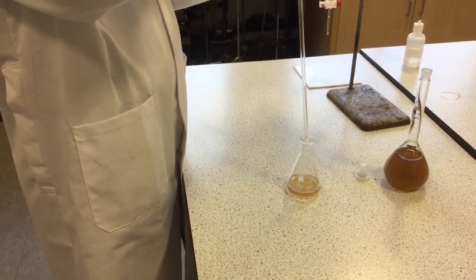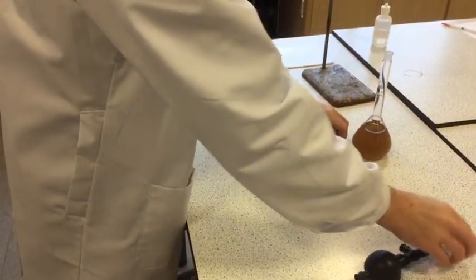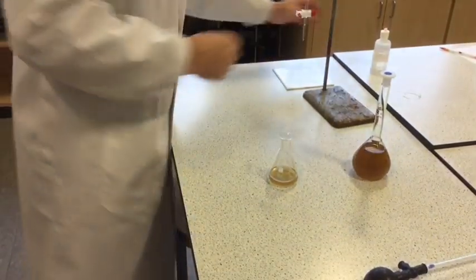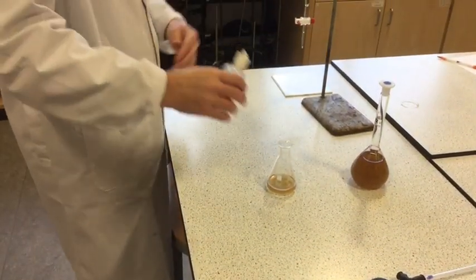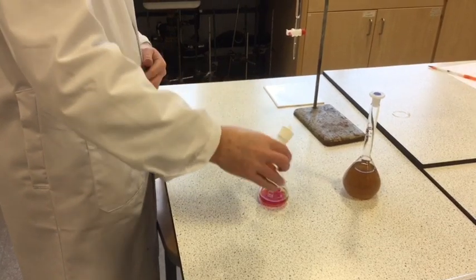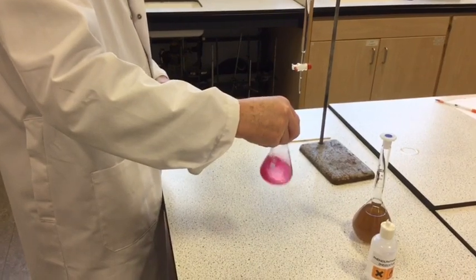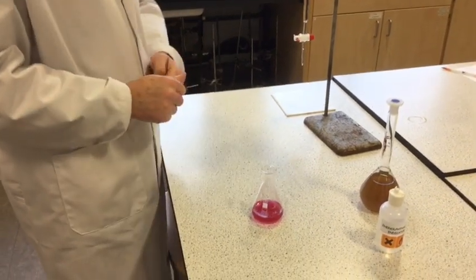Now, this solution should be alkaline, because it contains some of the unreacted, the excess sodium hydroxide. So, we add two or three drops of phenolphthalein indicator, and we get the pink color we get in alkaline solutions.